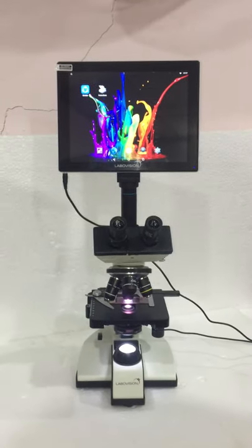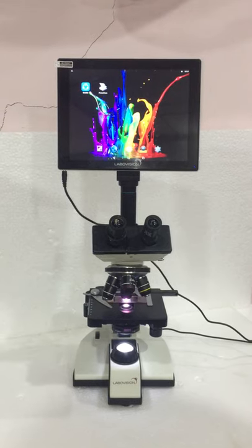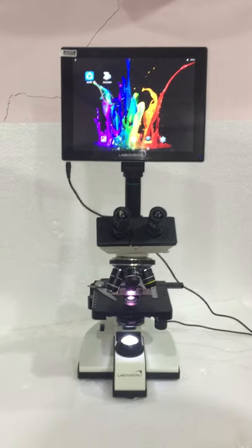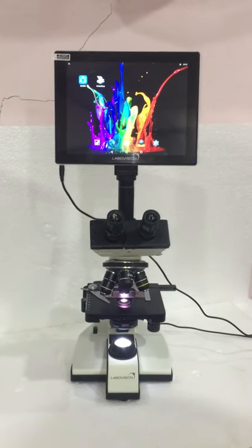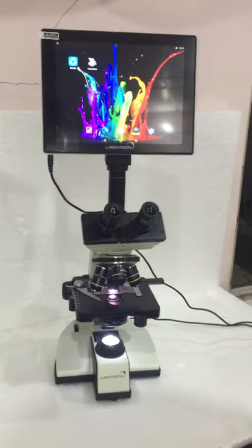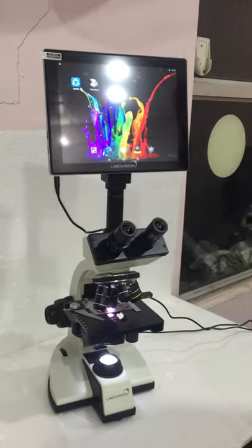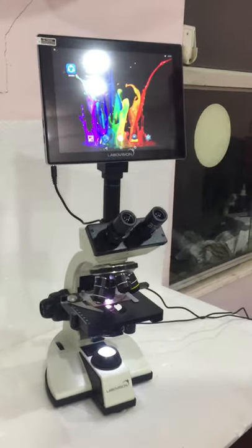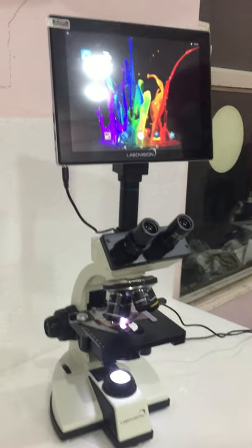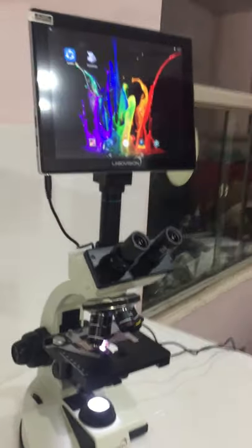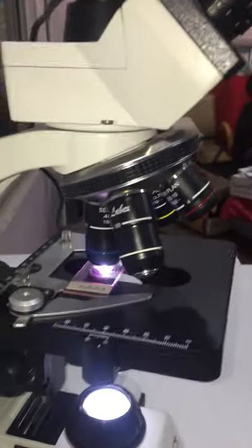Hello all, today we are demonstrating our largest selling microscope model for biological diagnostics, education, clinical, and research purposes. It has now been requested to show applying a heating stage on our double mechanical stage.